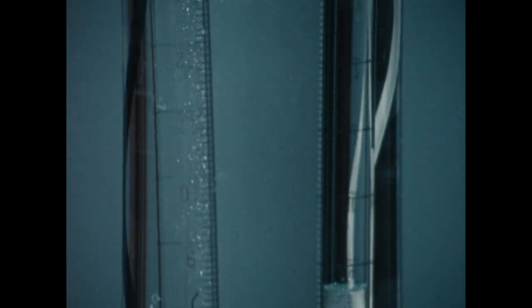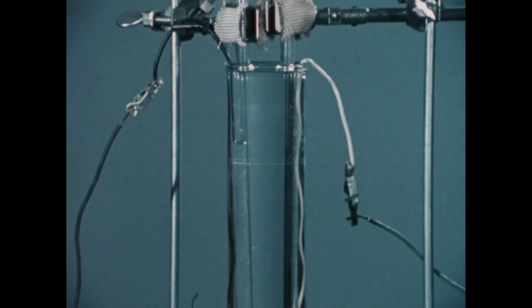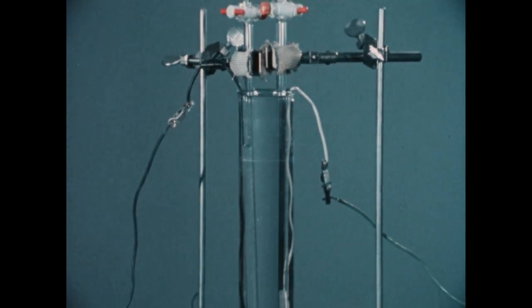Of course, what we're demonstrating is the electrolysis of water, the breaking apart of water into its constituent parts of oxygen and hydrogen. The purpose? To illustrate that water is a compound. A compound is a pure substance composed of two or more different parts that cannot be separated by normal physical means, the way the parts of a mixture can.